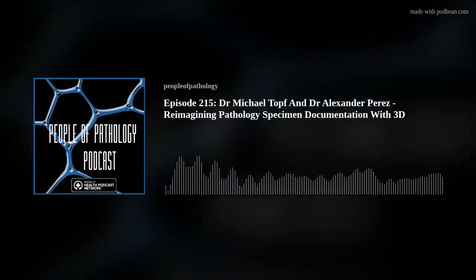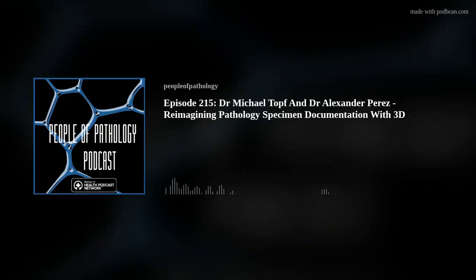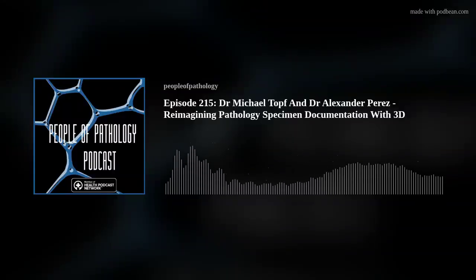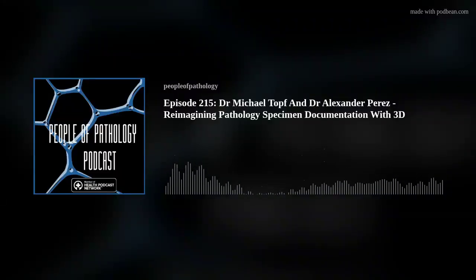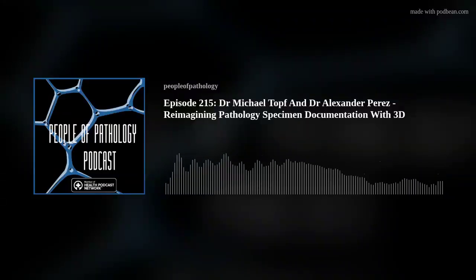So we actually started to 3D scan probably when Alex was still a resident. We did our 3D scanning in the pathology room, actually in the bone saw room of the pathology lab. And we quickly realized this wasn't a great long-term solution because, similarly to surgeons, pathologists don't necessarily like it if you turn off the lights. And we're using white light 3D scanning that does work best in the dark. So we actually built two separate carts that we have now. And these mobile carts allow us to basically close the door of the cart and perform the white light 3D scanning in the dark. These carts are wheeled outside the various operating rooms at our institution.